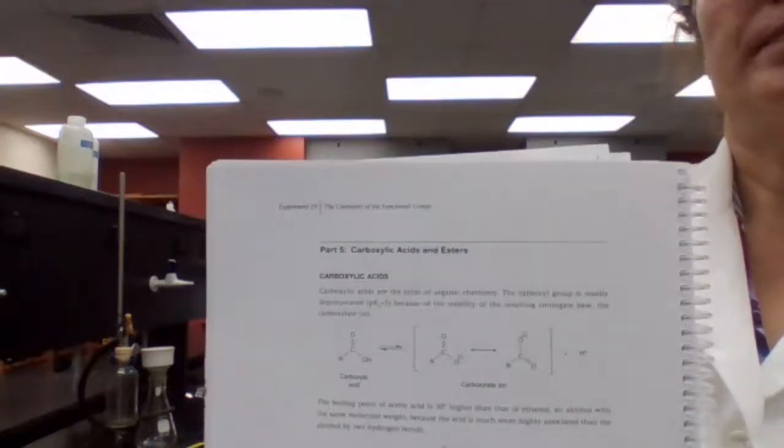Can you hear me? Yes? Okay. Based on the pH, it dissolves in water. All carboxylic acid would dissolve in water.